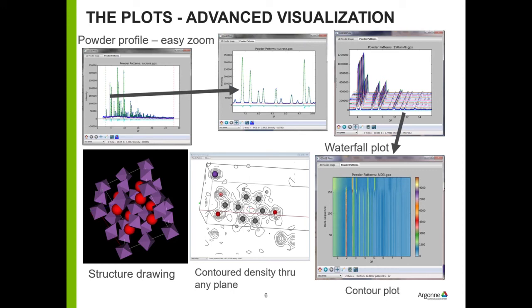And by the way, you can move these things around under certain circumstances. So if you don't like the layout, you can change it. You can zoom in easily. So that thing works. Maybe it's because my finger's in the way. You can zoom in so you can see the details of the fit, whatever it is, it's useful.